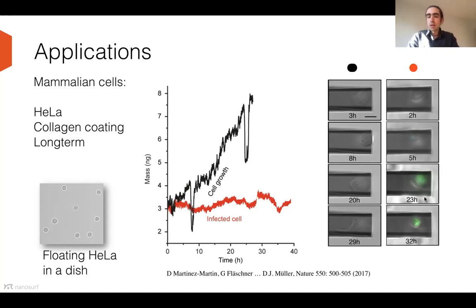So now here it starts the interesting bit, like why is that the case? Why does the cell stop growing actually? Because, well, we do see that there is a stop in the cell cycle, so there was no mitosis anymore, but it is actually not clear, or it's actually not always the case, that a stop in the proliferation also results in a stop of growth.